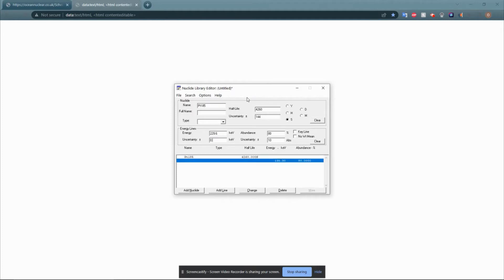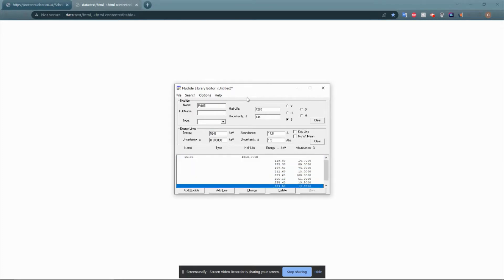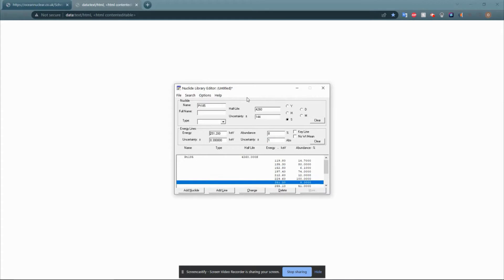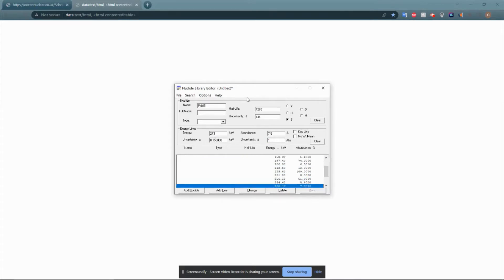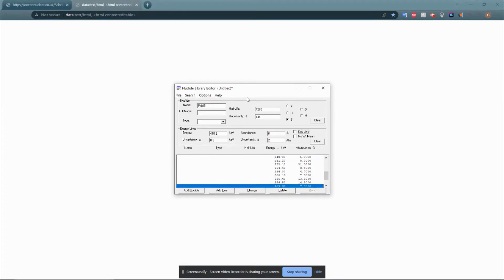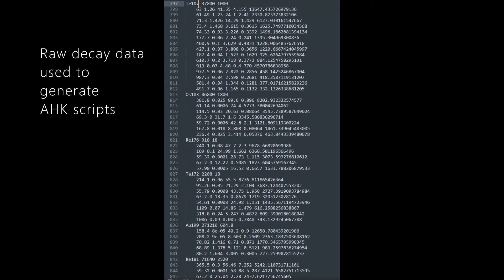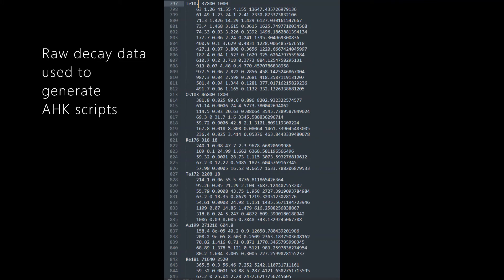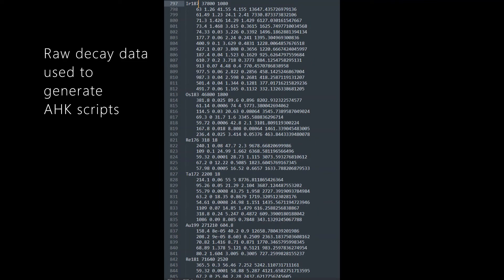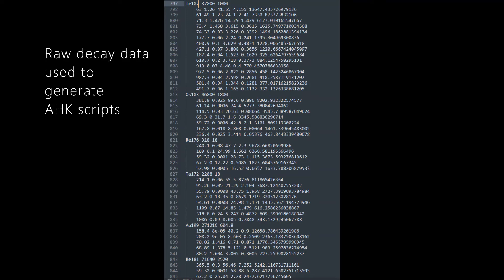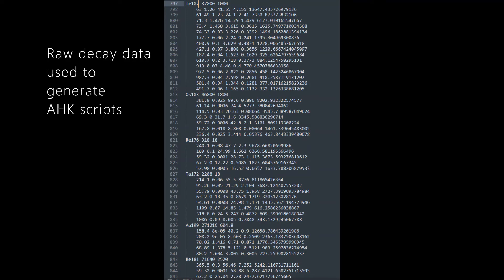Using a programming language of your choice, you can programmatically create AutoHotKey scripts so that AutoHotKey automatically enters data into the nuclide library editor for you. For example, this is the raw data that my Python script reads in to create AutoHotKey scripts, so you can think of this screenshot as a condensed format of the .nlb files.